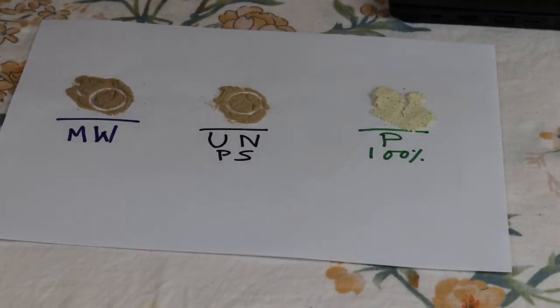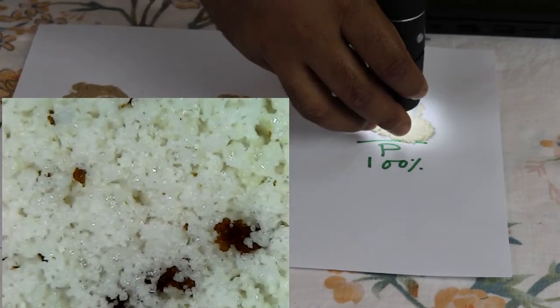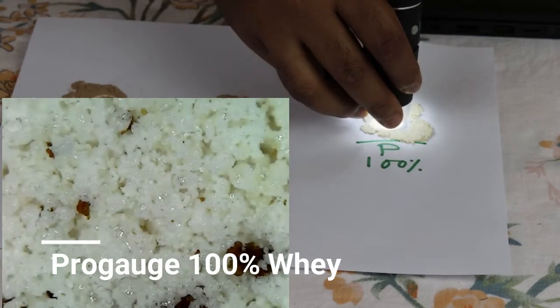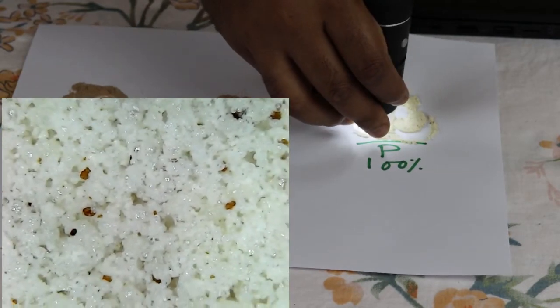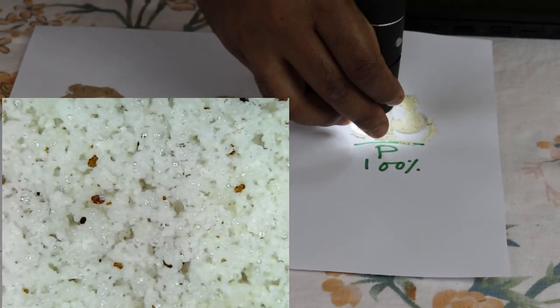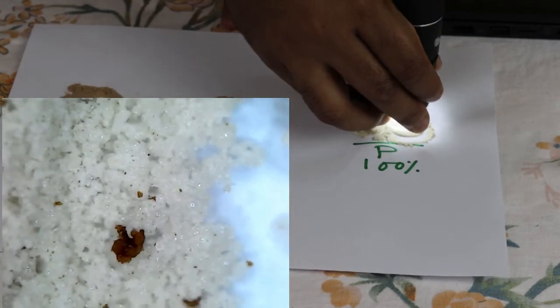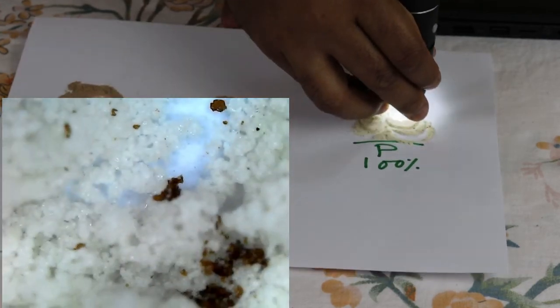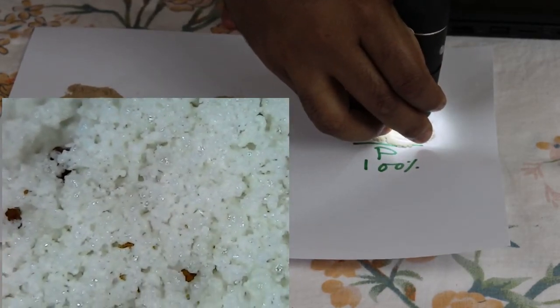All right, and moving on to Progauge, and this is the first time I'm doing a Progauge microscopic test. What I need to say is there could be some bigger granules because it's a cafe mocha flavor. That's what I expect. Let's just see how it is. So that's true. If you see, there are these really big chunks which I talked about. A similar thing we saw for Isosensation 93. Apart from that, what do you see? We see those crystals a bit, and the rest is proper whey protein structure. Surprisingly, I was thinking, do they have a bunch of additives or something? They don't. It's just simple, clean.